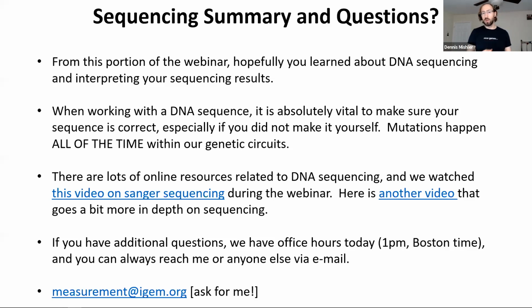So it's really important to look at the sequencing facility's specifications for what they need from you before you send in your samples. And again, if you have nanodrop, use it. It's better than nothing, but nanodrop is frequently off. And so I've seen sometimes the students will send in nanodrop samples and they'll tell us the concentration is just way too off. And so I always tell my students, if you have the time, use qubit instead and use that concentration. That will generally be better. So it just varies. Okay.